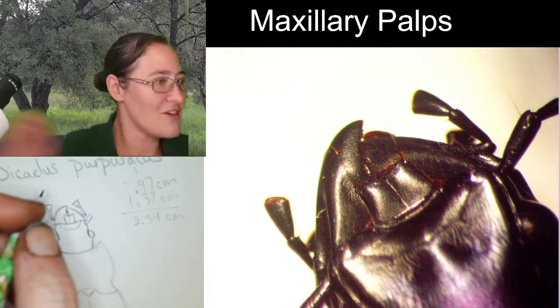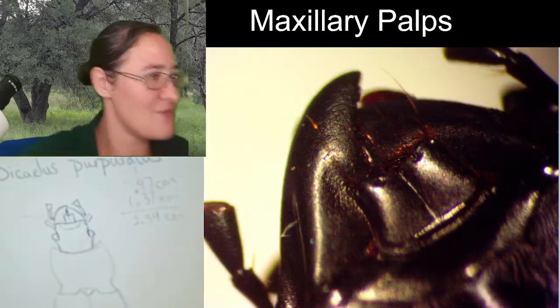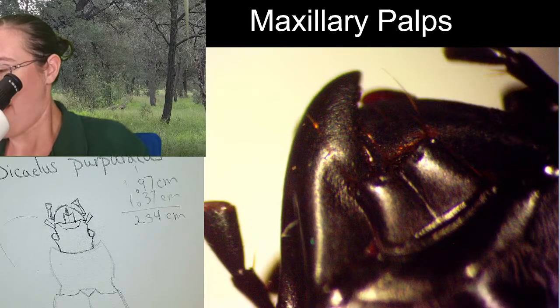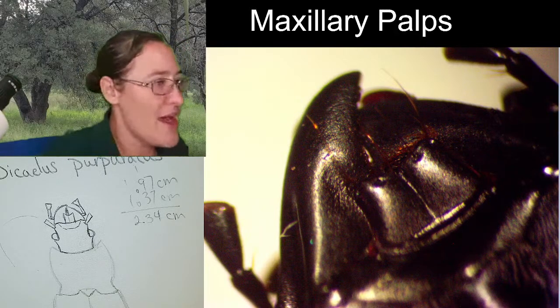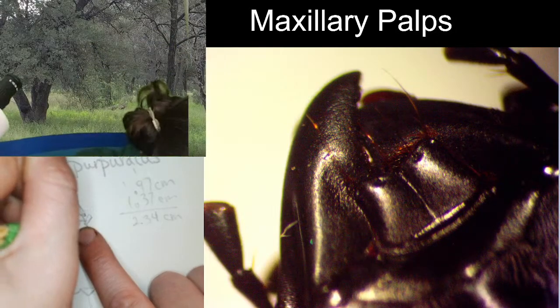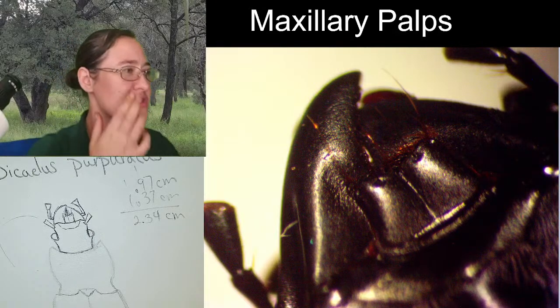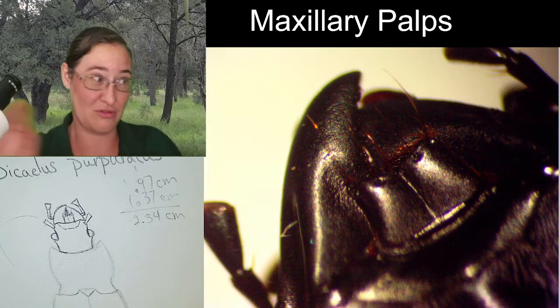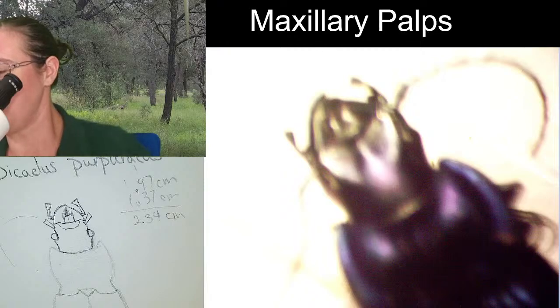All right. If you wanted to get down to details, I believe that there are four pronounced, I want to say they're bristles rather than setae. There's two on each one of these. So there's one on the right and one on the left. They look like hairs, but they're more coarse and they have a socket. And so I want to call them bristles. I would believe that they are sensory.